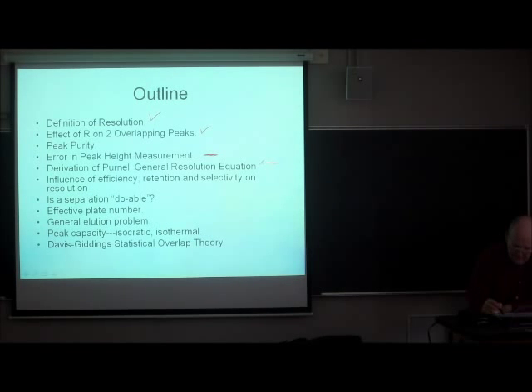And then I'm actually going to go through a derivation of the Purnell general resolution equation, which is really just a different form of the equation that defines resolution. It's an approximation, but it's an approximation written in a way which makes chromatographic sense and a way which allows you to see what is the problem. Why are the peaks not well enough separated? And there's three issues involved.